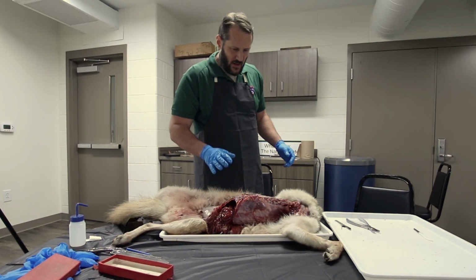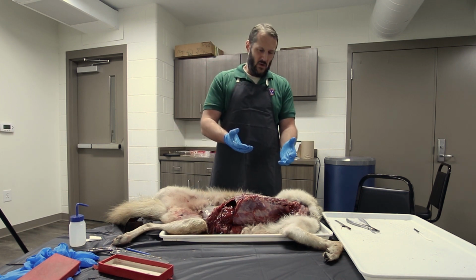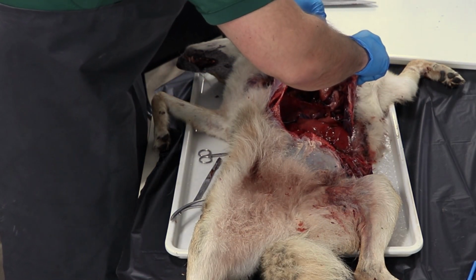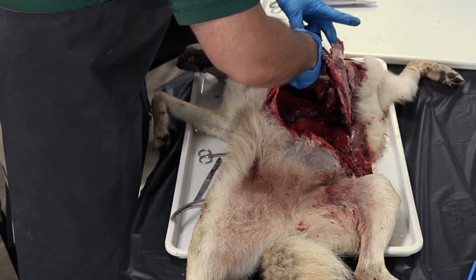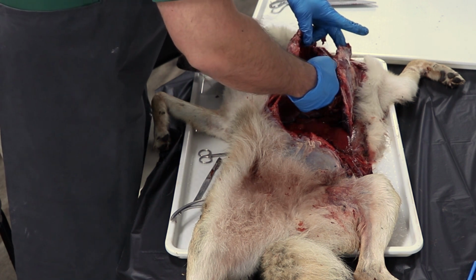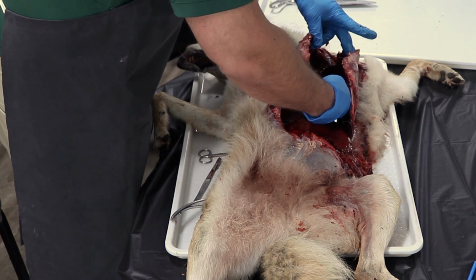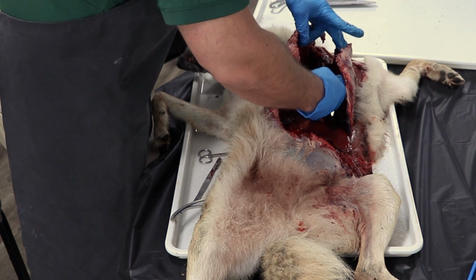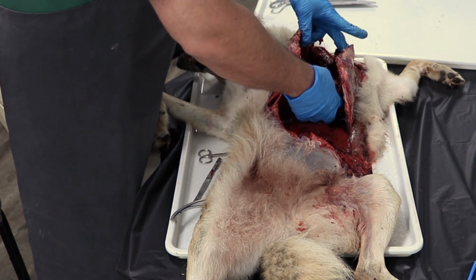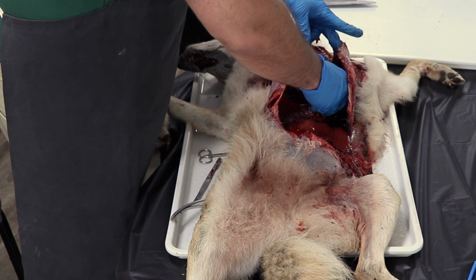All right, we're back. I've got the thoracic cavity and some of the abdominal cavity rinsed out a little bit. Don't know if it made things better or just made it worse. All right, so when you really get a good look inside, what is it we see? Well, we can see a big, fleshy, deflated right lung right here. And over here, here's another big, fleshy lung. It's got its lobes. And looky here, we have a large four-chambered heart right in the center of these lungs. You can't really see it because of the mesentery.